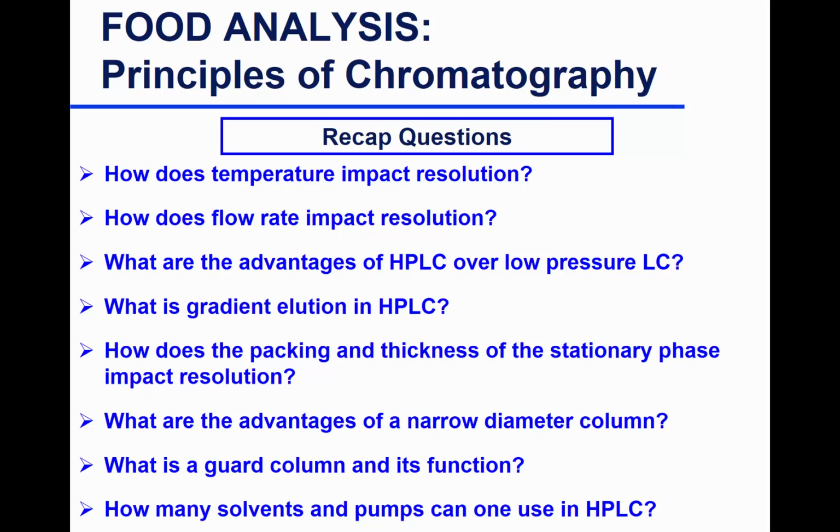So you have the high performance liquid chromatography, your stationary phase is packed under pressure, so you have very few free spaces. That means you don't have a lot of room for your solute to go in and wander. So it's pretty well packed. So resolution is really better than low pressure chromatography. That results in also higher efficiency rate. Basically, your analysis time is shorter, better resolution, more efficiency in general. Better for quantification because you have better resolution.